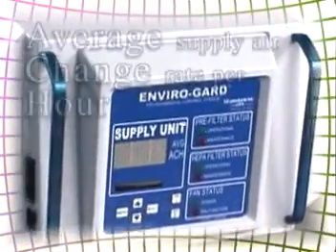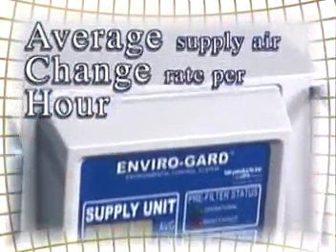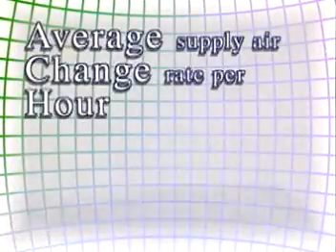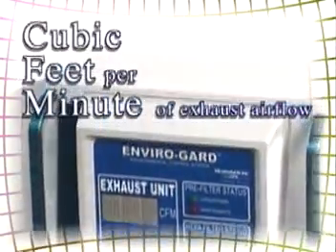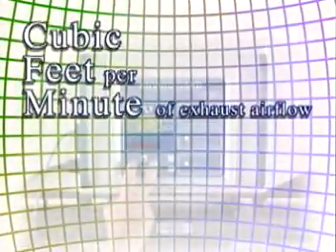The supply unit features an easy-to-view display of the rack's overall average supply air change rate per hour. The exhaust unit displays the overall average cubic feet per minute of exhaust airflow rates.